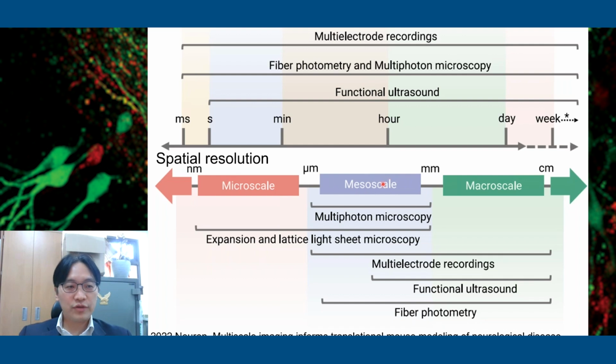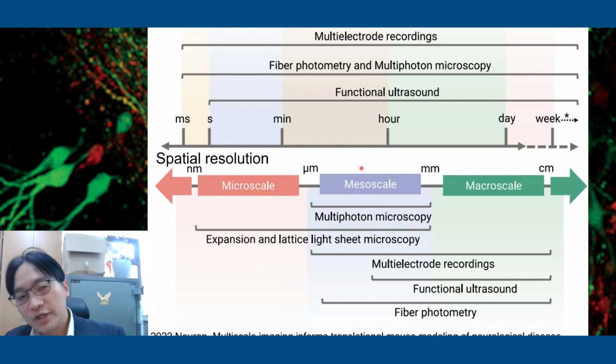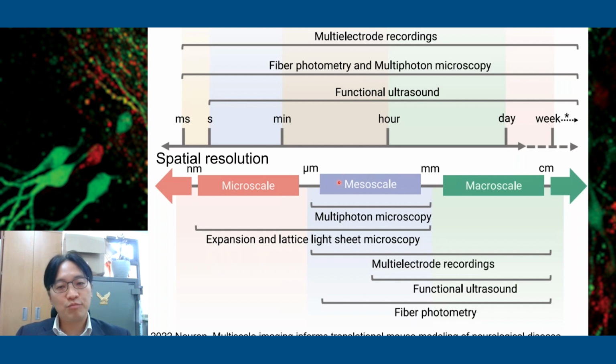So about this measure scale, time limits are important. I think this miniscope is good for this spatial and temporal resolution, so we can have a single cell recording within a sub-second temporal resolution.